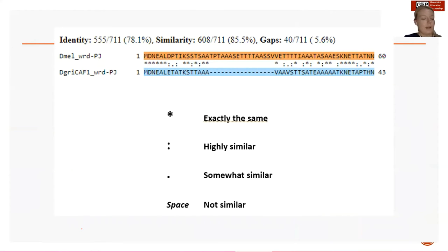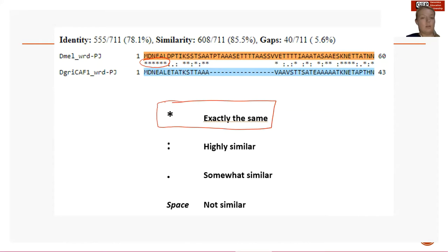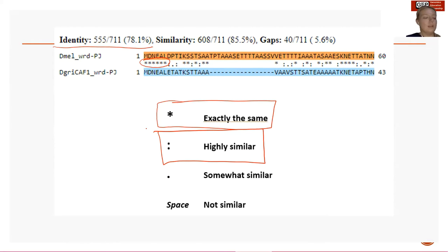Now that we know how to read an alignment we can move on to the actual analysis. Between each of our amino acid sequences we will see a symbol that gives us information on how similar each amino acid is between the two species. We are currently zoomed into the first line of our first exon. An asterisk appears between our first six alignments — an asterisk tells us that these amino acids are exactly the same, they are identical, so they will contribute to our identity score. A colon means that the amino acids are different in structure.